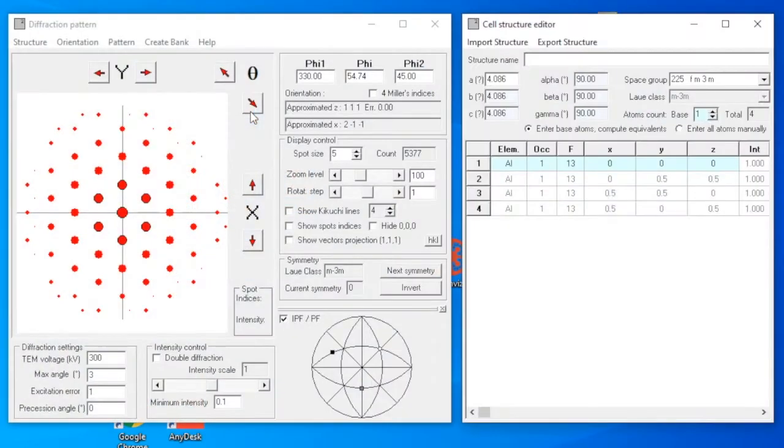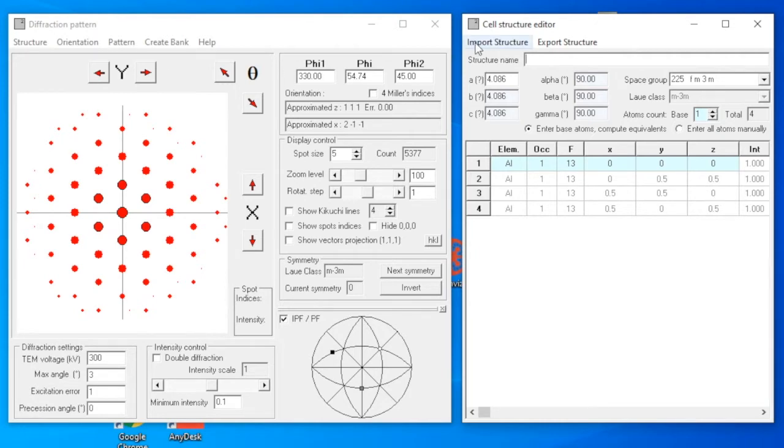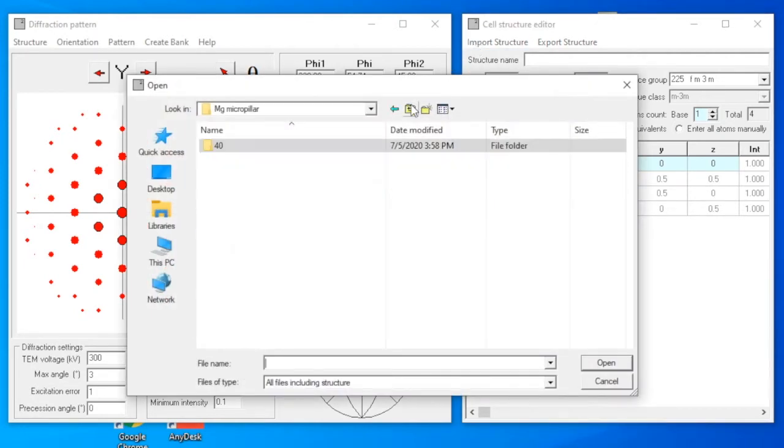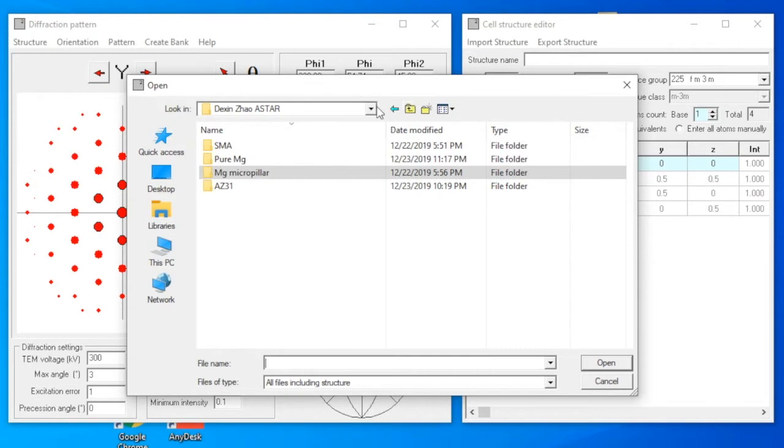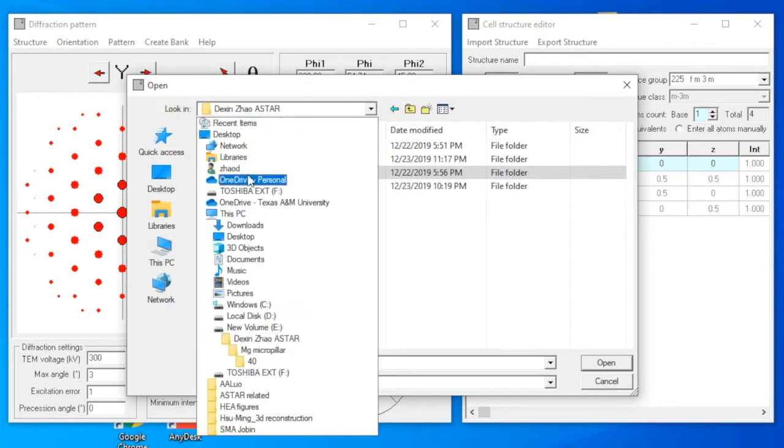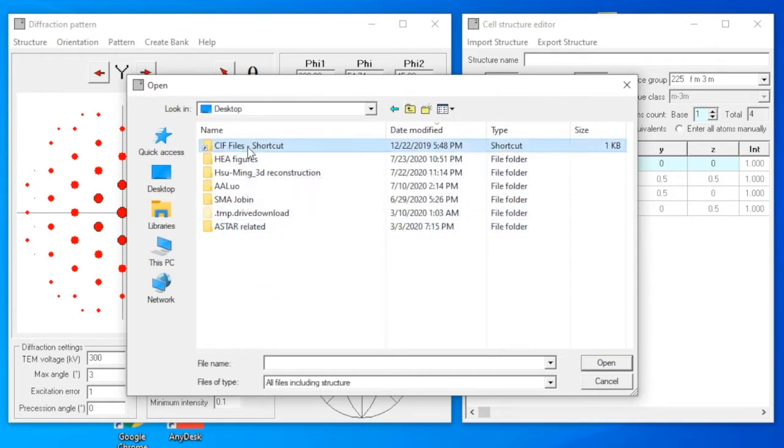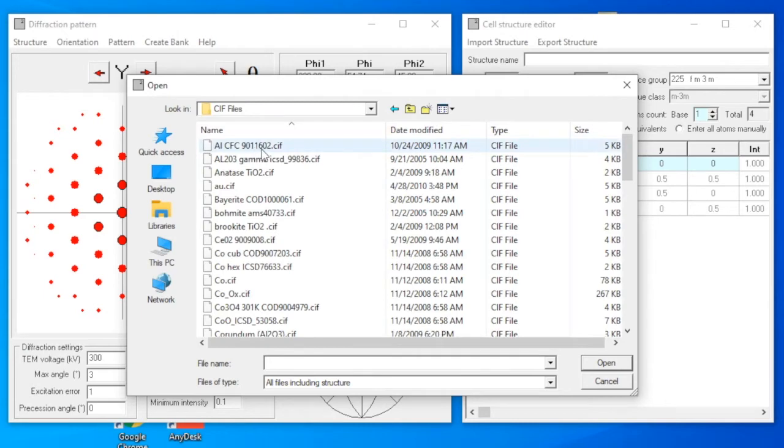What you see here is the diffraction pattern from the reconstruction of the previous work. From the cell structure editor, click on import structure. Since we know it is gold, we can just select the cif file of gold, which is the au.cif file.